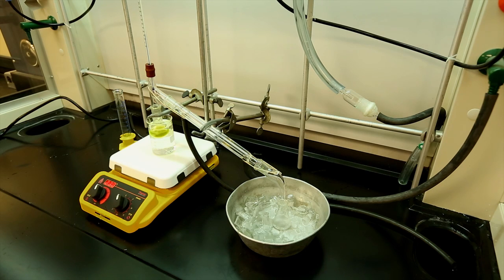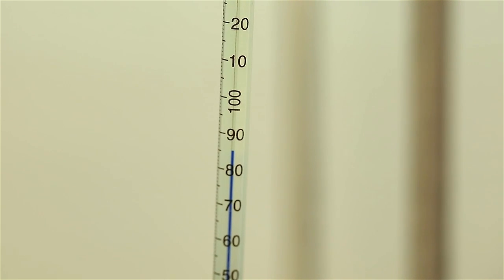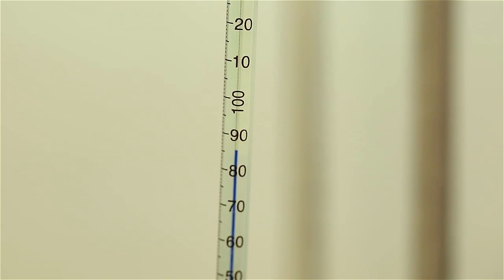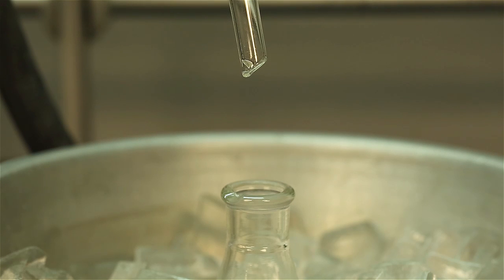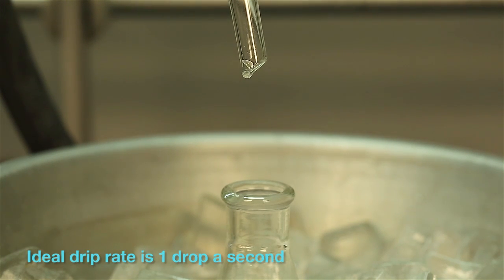As you are collecting your product, you will notice that the temperature plateaus. The distillation is completed when the temperature rises above the plateau or when there's only a few milliliters of solution left in the flask. You never want to distill to complete dryness as it increases the risk of breaking the glassware, formation of tar or peroxides.